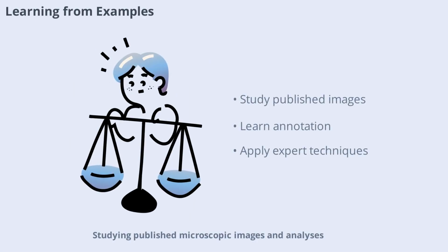Studying published microscopic images and analyses can help you improve your own skills. Look for examples in scientific journals or online databases. Pay attention to how experts annotate, measure, and interpret their images and apply these techniques to your own work.